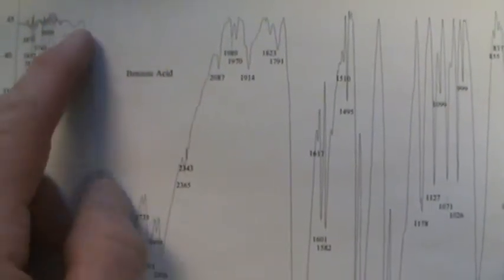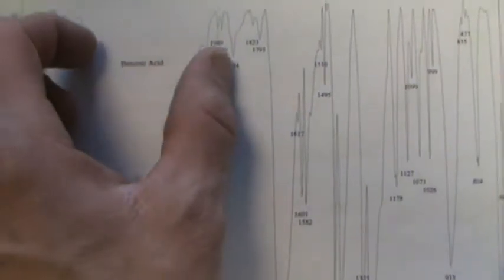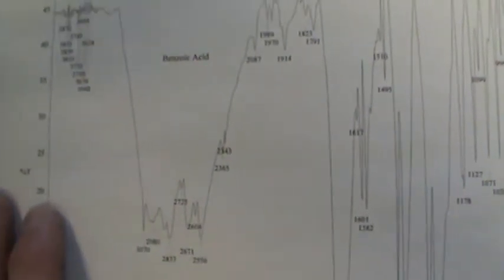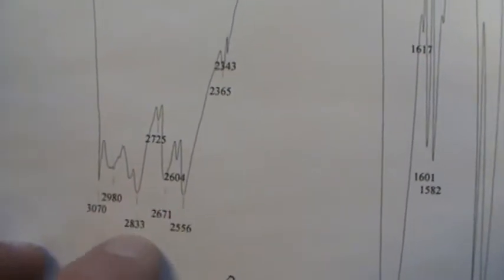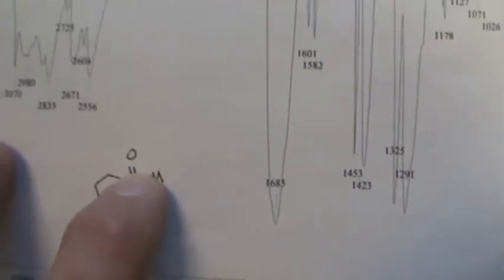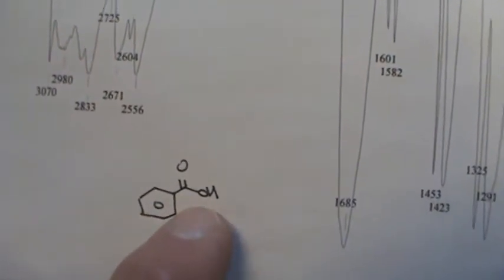Obviously, just like all acids, when you look in Pavia, Pavia might label across the top, pointing at this as your OH stretch. Other books will just circle this, representing that the bulk of this overwhelming absorption comes from the OH stretch of a carboxylic acid. Whether you start labeling any of these tips, sometimes it's a little sketchy. That can legitimately be part of the CH stretch. But if that was so true, then why are we seeing so many strong peaks at less than 3000? Because there are no sp3 carbons with hydrogens on them.